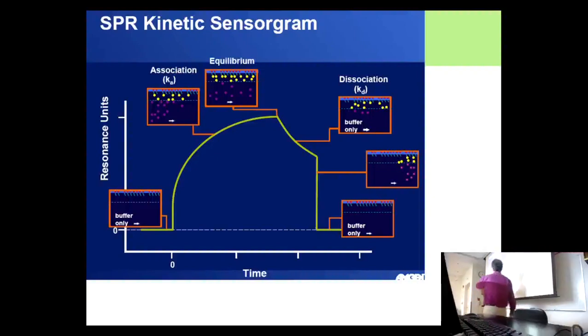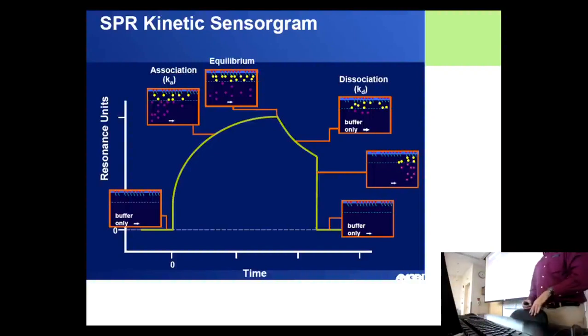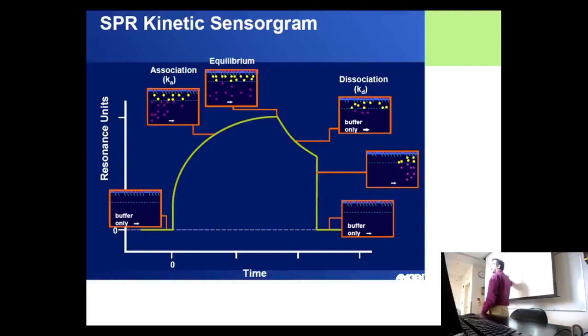The main thing is you start off with a baseline, you inject your sample. You see your sample, your line goes up if your sample's binding. If you have more sample in there, your line will go up farther. You stop injecting your sample, and the line starts to go down because stuff is falling off. If it's still up too far, then you regenerate it, and what the regeneration means is you add a harsh chemical to break all these interactions and bring it back to baseline. We have pretty good regeneration conditions right now because we have worked with this particular fragment before, so it should work, and we should be able to do all steps of this. The only important thing from this, if I say we have to regenerate the chip, what that means is we have to knock off all the stuff that's still stuck on there, and we have to return to baseline to do another injection.